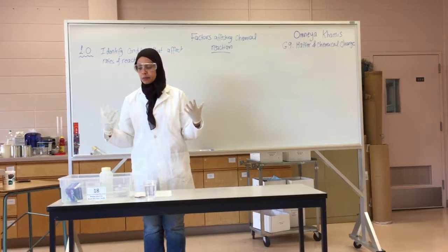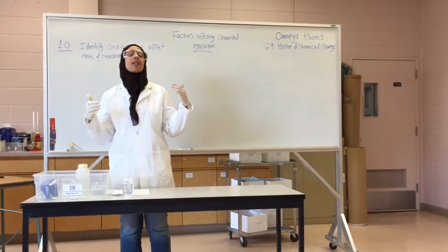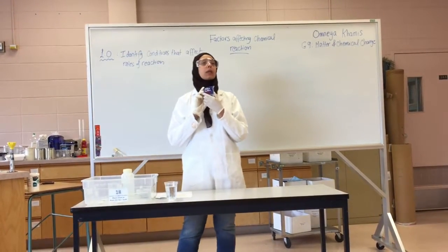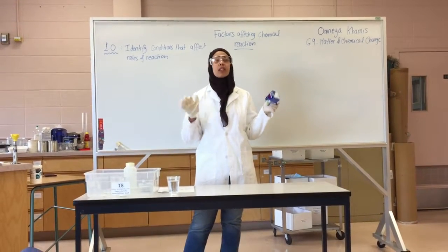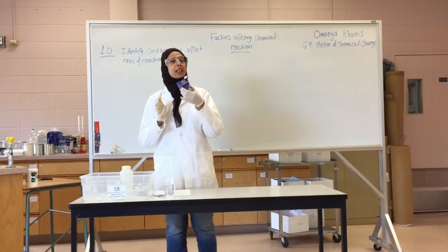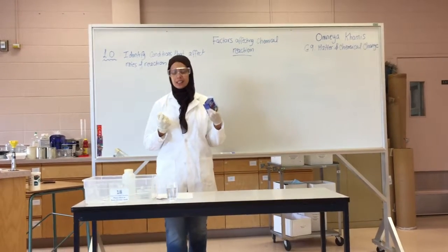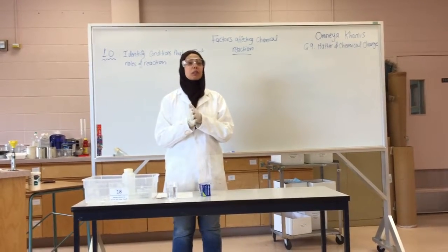Okay, so today I have a problem for you and I want you to solve it with me. I have severe flu symptoms and I'm very sick. So I went to the pharmacy and got Alka-Seltzer, and they told me that this is a pain relief. However, I need to relieve that pain very fast because I have a lot of things to do and a lot of things to study. So can you help me take this medication and have quick relief of pain? Any ideas? If not, this is what we're going to explore today.